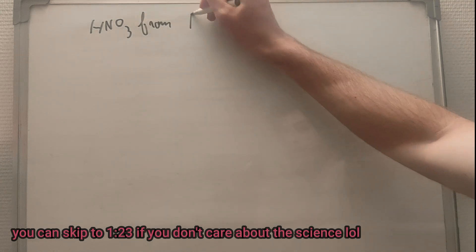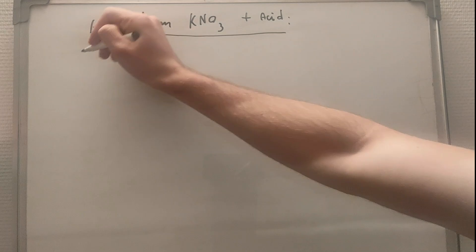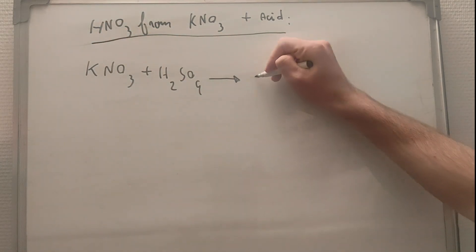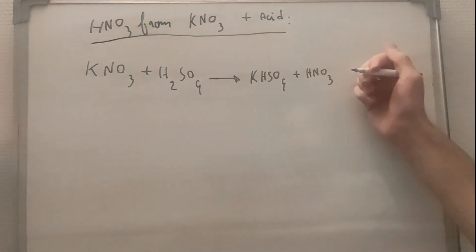So there are multiple ways of making nitric acid. Usually we do a distillation of a nitrate salt with another acid, but there are alternatives like using bisulfate instead of sulfuric acid. I don't have any bisulfate right now, so let's just use sulfuric.